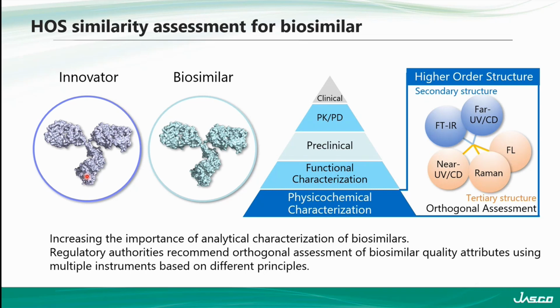Early on in the development process of these materials is a lot of the time where this chemical characterization takes place. And in terms of proteins, there's 2 major types of structure that we're really interested in terms of spectroscopy. The first is secondary structure, which is our alpha helix, beta sheet, turns, and random coils. And those are really nicely identified by either far UV CD or FTIR. And so those methods will work in tandem to identify secondary structure.